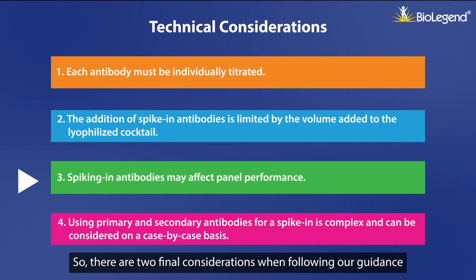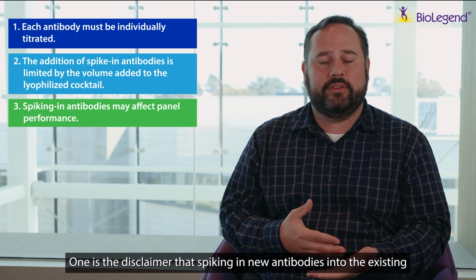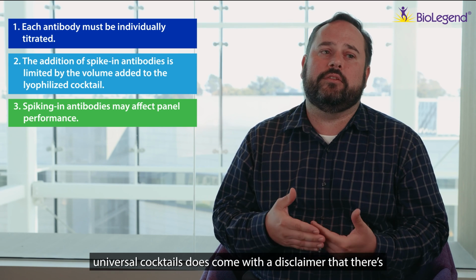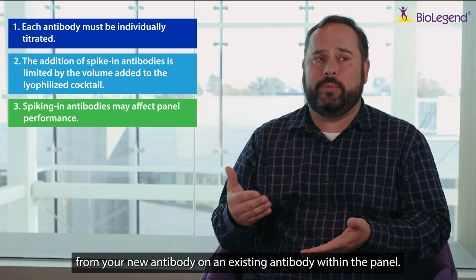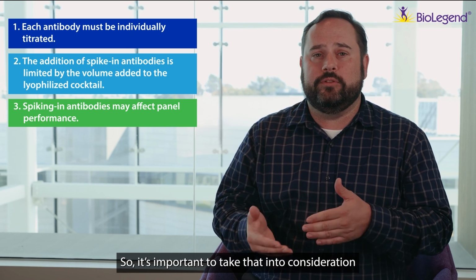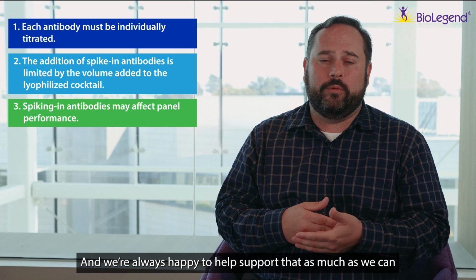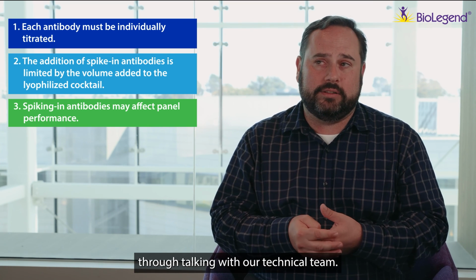So there are two final considerations when following our guidance that I would add in. One is the disclaimer that spiking in new antibodies into the existing universal cocktails does come with a disclaimer that there's no guarantee that there might not be an effect of your new antibody on an existing antibody within the panel. So it's important to take that under consideration when examining your data, and we're always happy to help support that as much as we can through talking with our technical team.